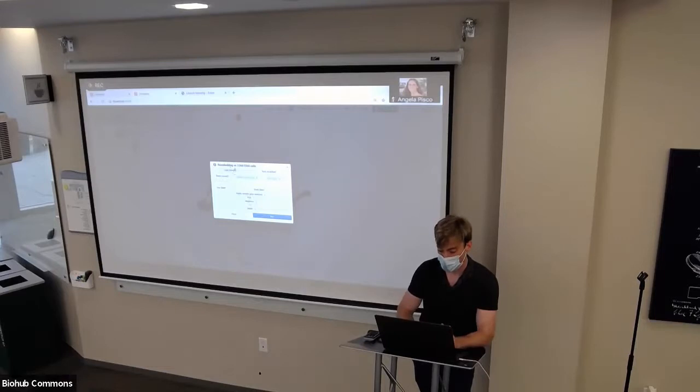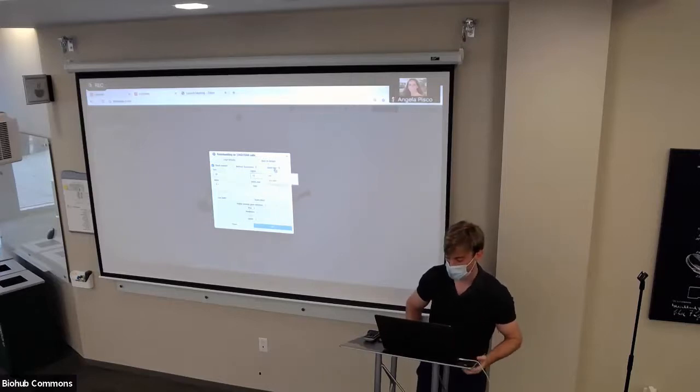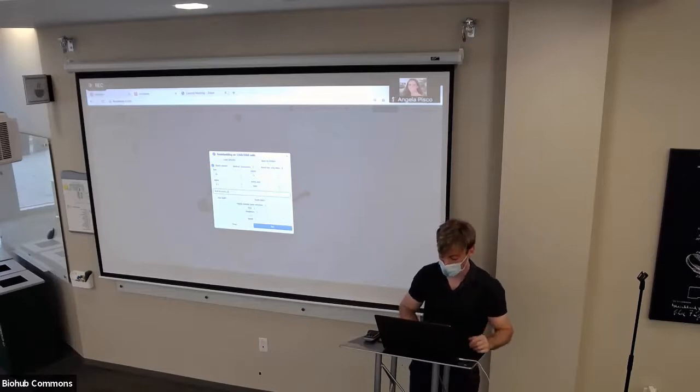So now we're going to open this menu. All the cells are selected. It's saying that we're going to be doing re-embedding on 3,368 cells out of 3,368 cells. We're going to hit batch correct. And then there are multiple methods. Again, these all should have tooltips, but if you're familiar with Scanorama, you'll know they have these different parameters, but I typically leave them as default. And then we choose the batch key. It's again orig.ident. And then let's say we want to name this new embedding batch corrected. So we type that in.